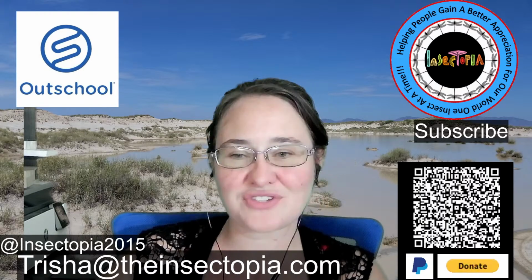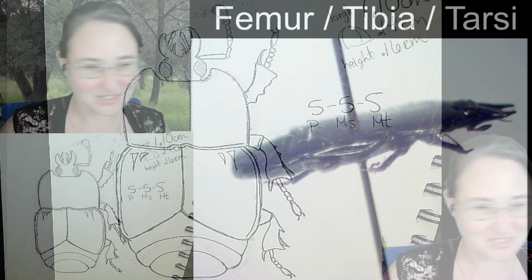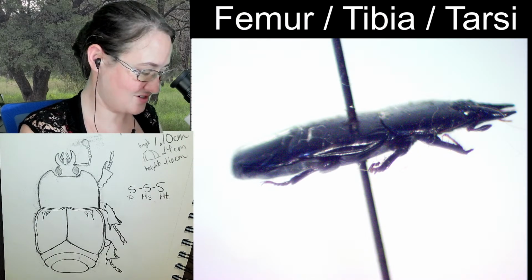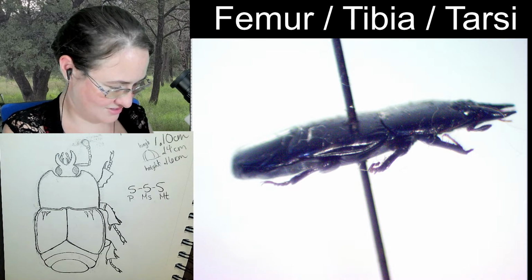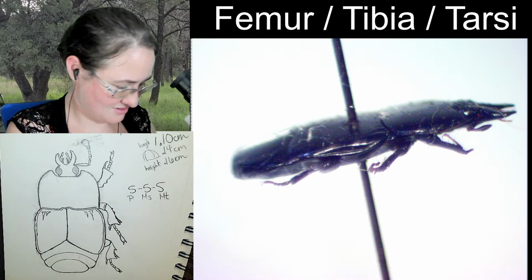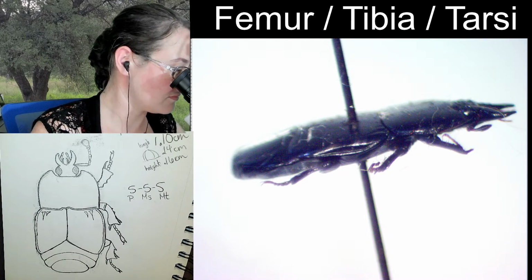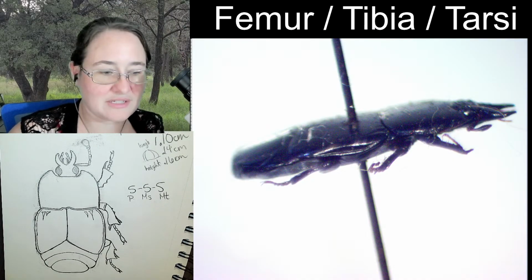Quick look at the underside, of course. Alright.